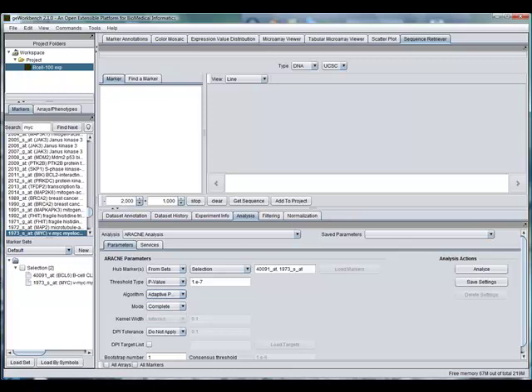Next is the mode. It is used to control the calculation and the use of runtime parameters from the input dataset. It has 3 modes: complete, pre-processing, and discovery. The pre-processing calculates the required parameters and writes them to parameter files. It takes a long time to run. It only needs to run once for each dataset.